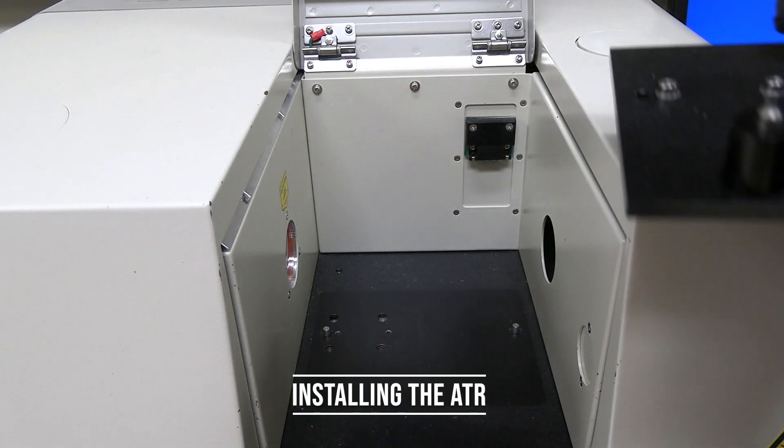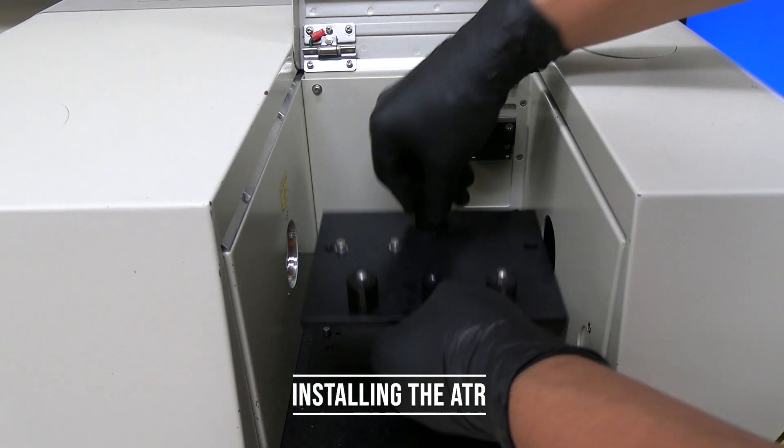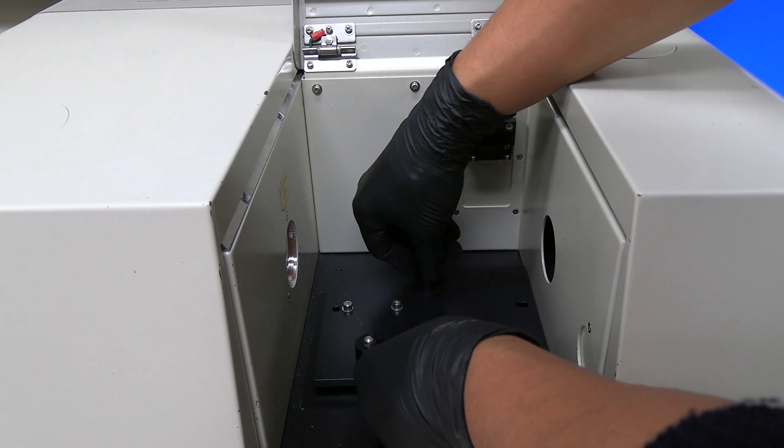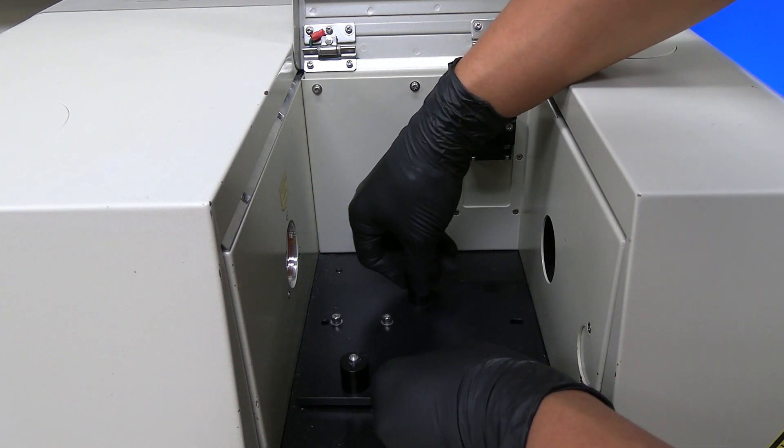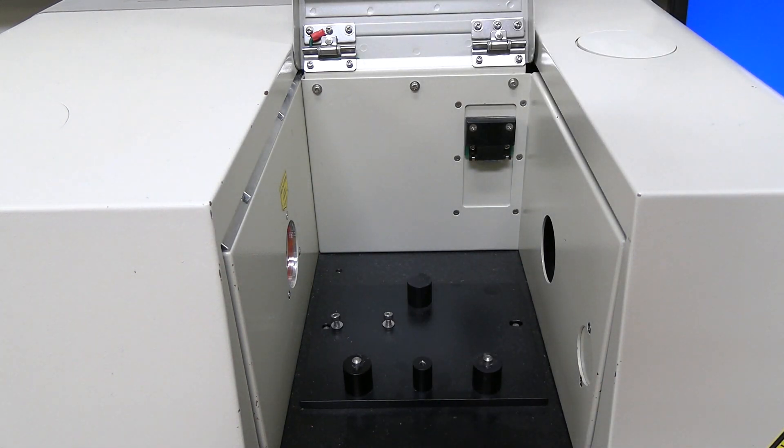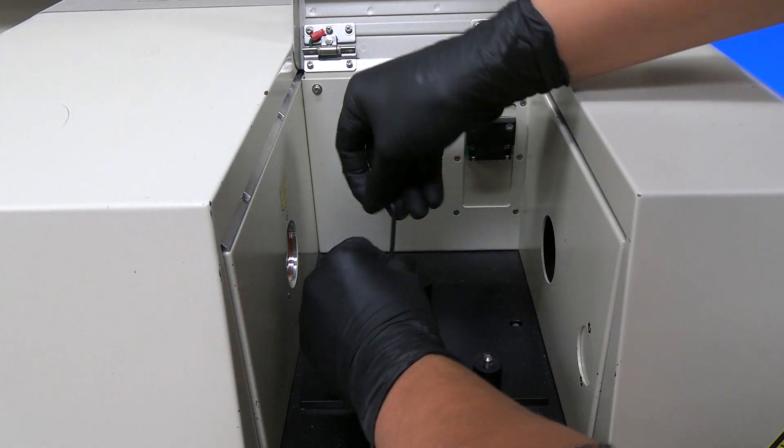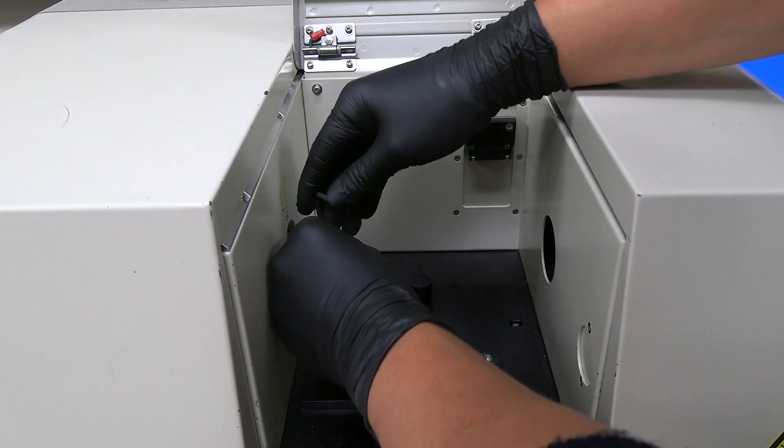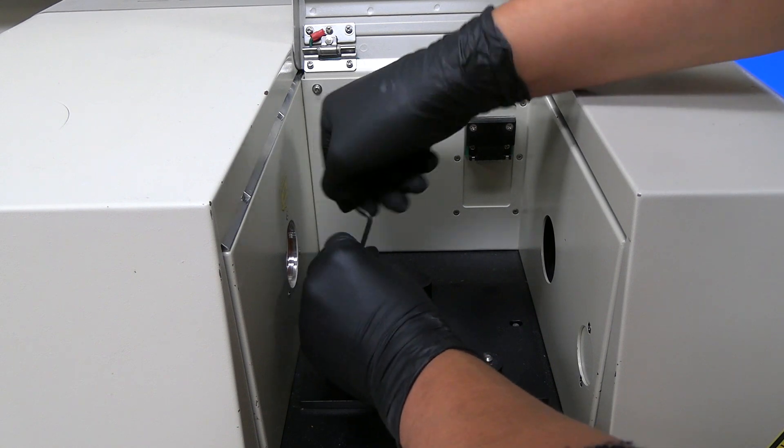Install the ATR. Insert the base plate into the sample chamber. There are pegs in the sample chamber that align with the holes on the base plate. Use an Allen key to secure the base plate to the instrument with screws. Be careful not to touch the window on the left side of the cell.